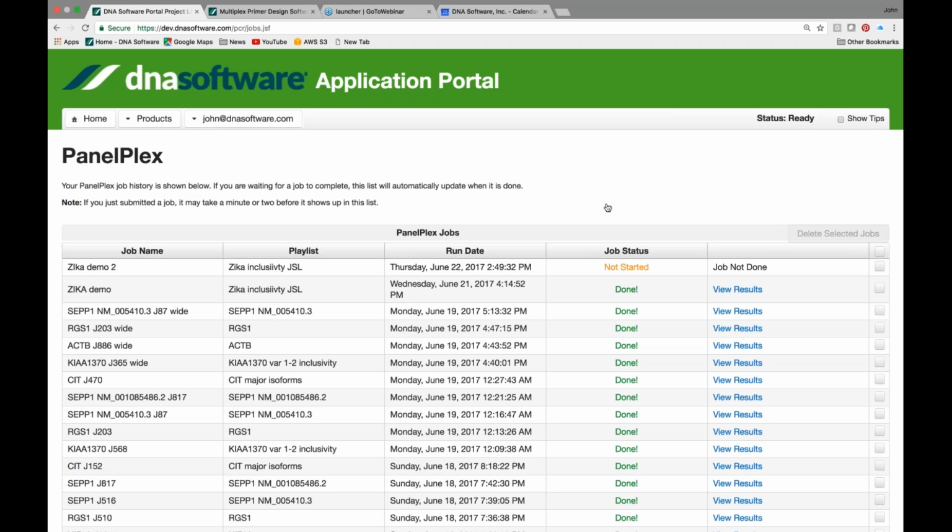Well, this job takes about 8 hours to run, and I ran one last night. I started it at 4 p.m., and it was ready this morning when I came in, and I wanted to show you the results. So it's just like those TV commercials where they put it in the oven, and then they take out the version that's already done. So I'm going to show you what the results for Zika virus look like.